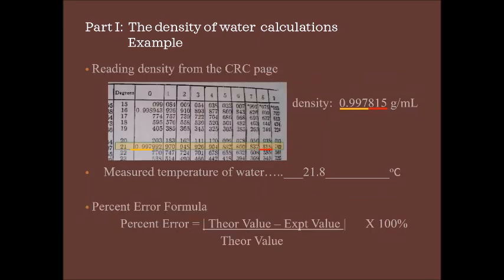So why did we get the temperature? If we look at the temperature, we say it's 21.8 degrees. So we go on degrees and say 21. So you're going to look at this row on your sheet, and you're going to go all the way across to the 8. And it turns out the first 3 digits remain the same. So it's 0.997. That's why it's underlined in orange right here. That hasn't changed. But as you go across and even down, you see there's nothing here.